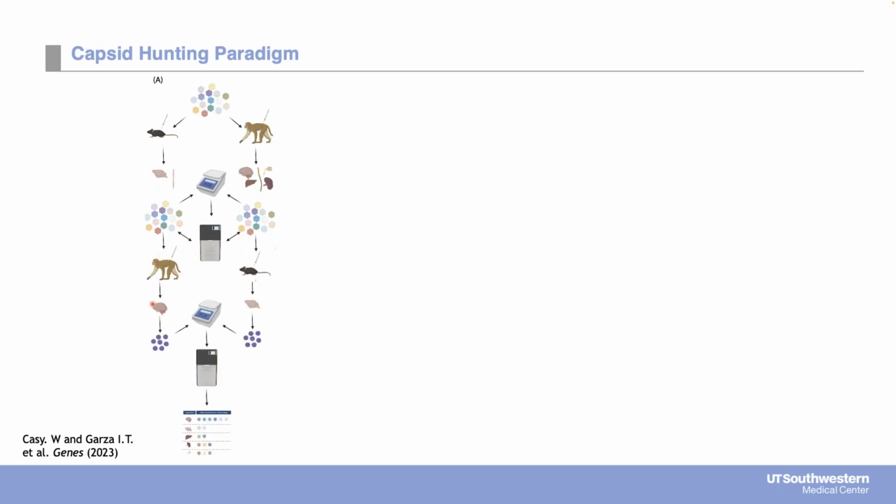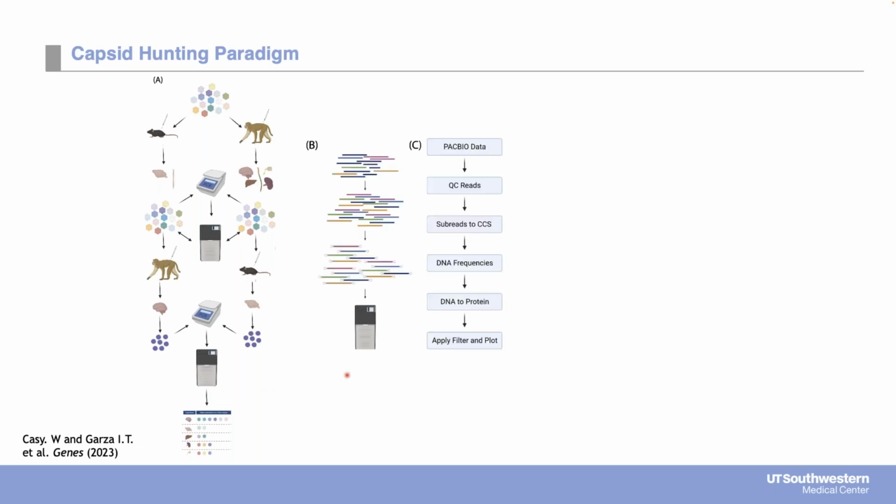And we followed that same fashion where we collected the CNS tissues. In the second round of isolation, what we actually did is we isolated the nuclei from the tissue, and this allowed for increased stringency, and we'll go over that in a couple slides. It increased the stringency of selection so that we could select for capsids that made it successfully to the nucleus. Once again, we utilized PCR to amplify the cap gene and SMRT sequencing to identify which capsids were specifically enriched in those tissues.